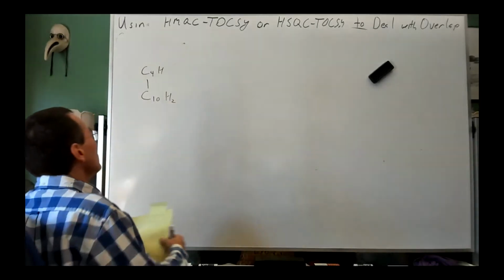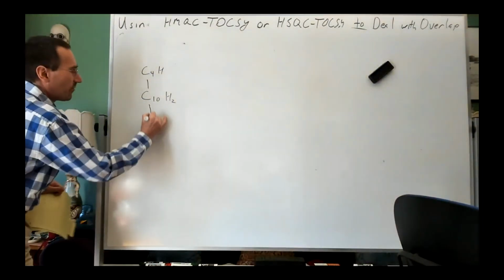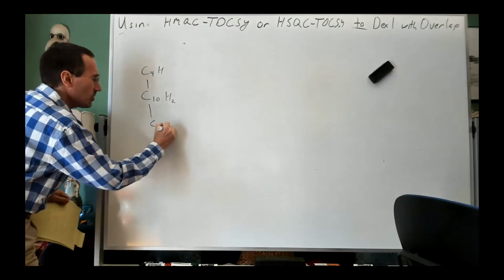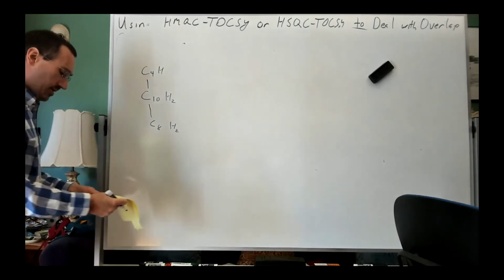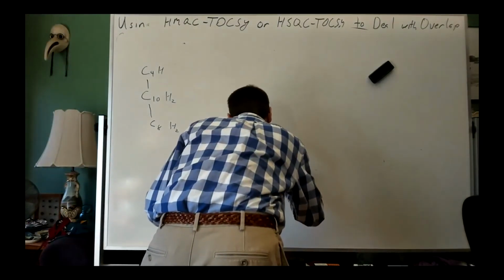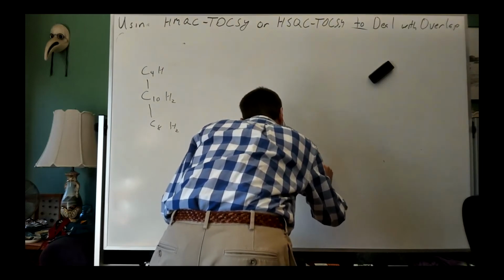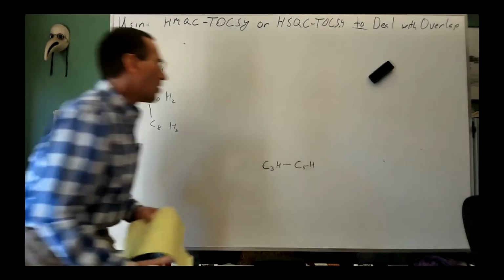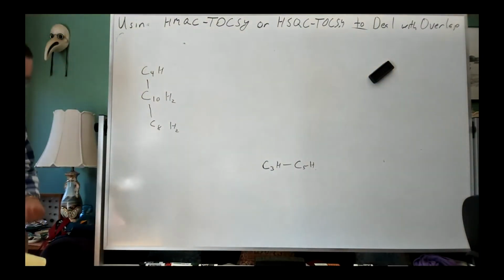Now unambiguously, we've gone from C10H2 to C8H2. We had C3H, we've gone to C5H. So we're starting to build up the structure rather nicely.